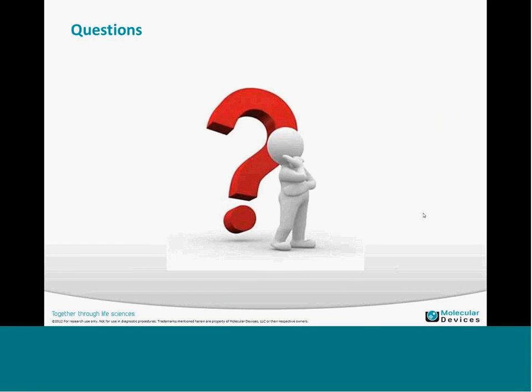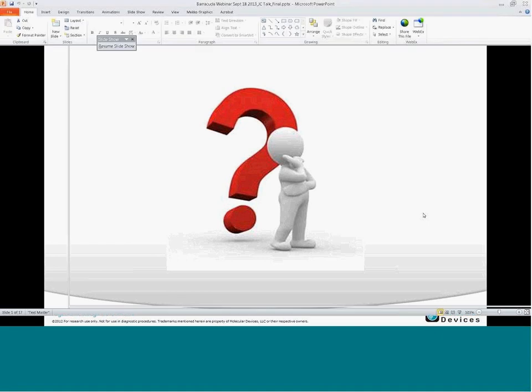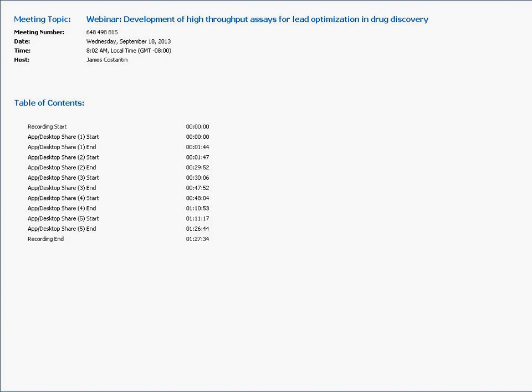With that, we're going to wait to take the questions until the end. So I think what we'll do is, I'm running a little bit late, I'll go ahead and hand this over to Jeff Weber, who's our product scientist for IonFlux, and he'll be presenting an introduction to the IonFlux instrument, which we're now selling through Molecular Devices. So, Jeff, if you're ready, I'll go ahead and pass it over to you. Okay. Thank you, Jim.